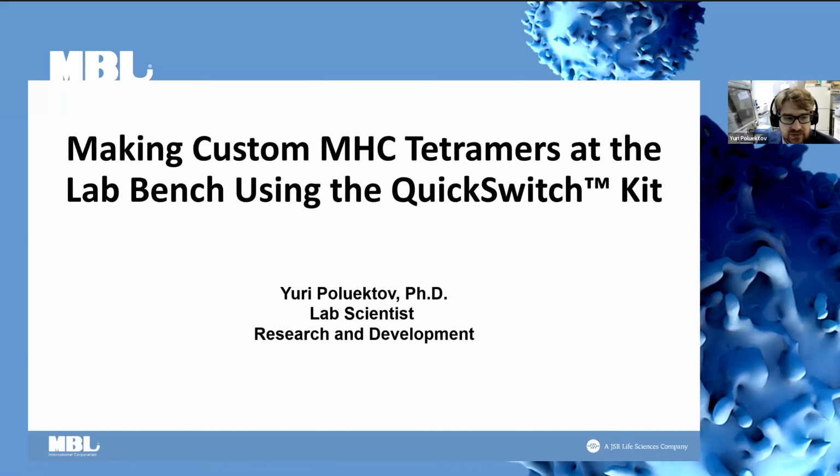Okay, my name is Yuri Poluektov, and I'll be talking to you about making custom MHC tetramers at the lab bench using the QuickSwitch kit.